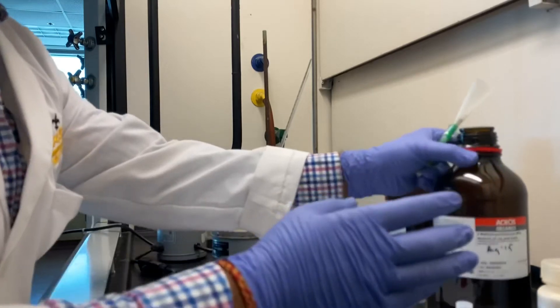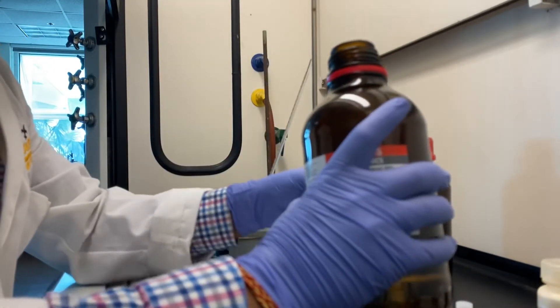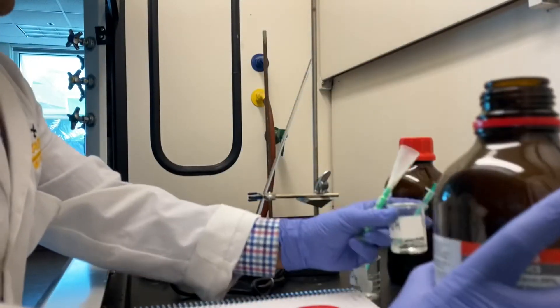Measure out 2-methyl cyclohexanol with a small syringe and inject it through the same plastic funnel.